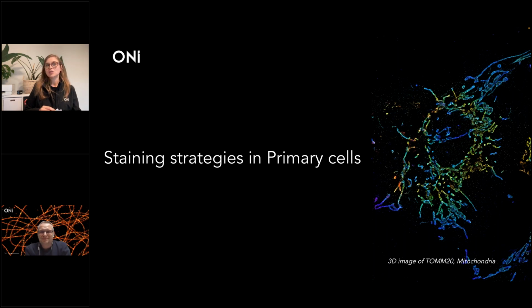So would you say it is also useful to use blocking with serum in cell lines, or does that not really matter so much? So you can have cell lines like a THP-1 cell line, which is a macrophage cell line, which will have Fc receptors. Right. So I recommend that. I will just double check whether my cell line contains Fc receptors.